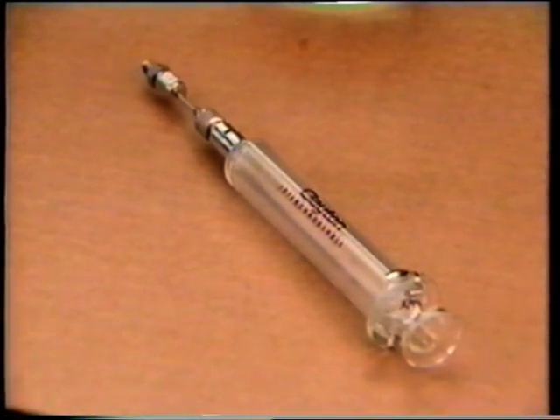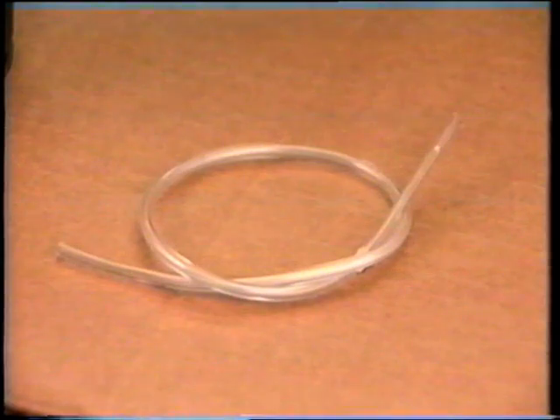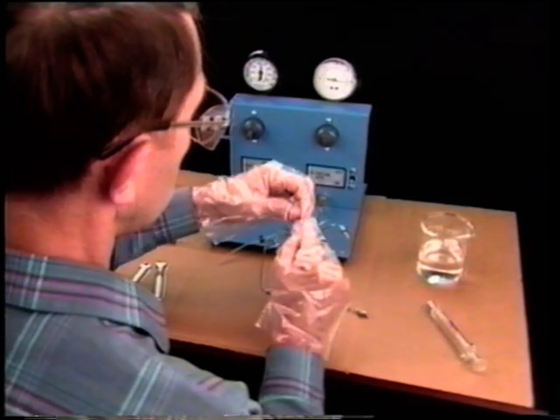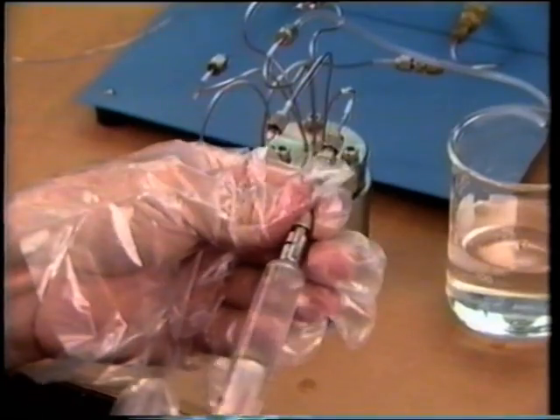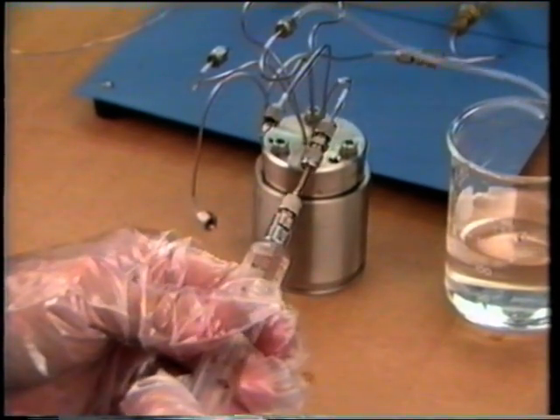For this procedure, you'll need a large syringe fitted with a tubing adapter and filled with hexane, acetone, or methanol. You'll also need a small container half full of the fluid, a length of clear tubing, and a source of compressed air. Connect one end of the clear tubing to port 2 and place the end in the container of cleaning fluid. Begin by connecting the syringe to port 1 on the valve.